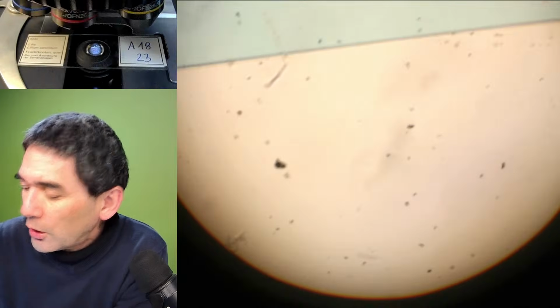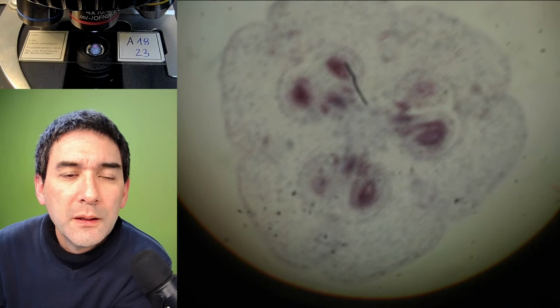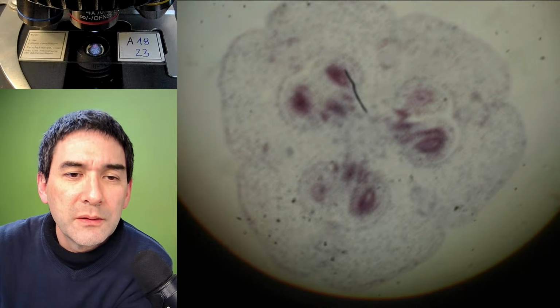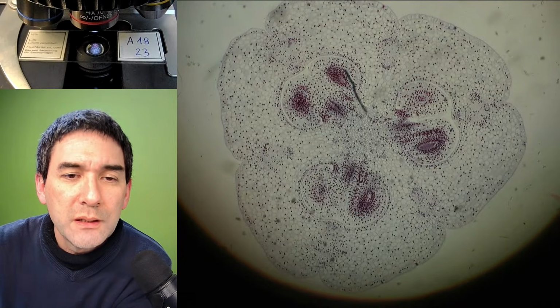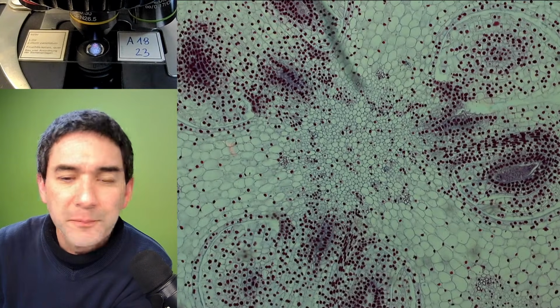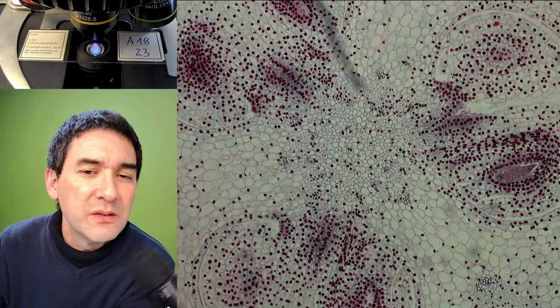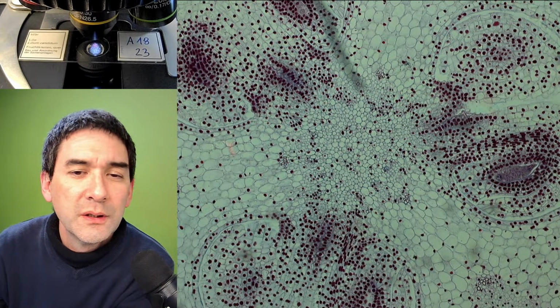I always start at the lowest magnification. Here we go. Again, it's a little bit dirty, but each tiny little dot is a nucleus. So this is a stained specimen. If I change the prism around, you see it doesn't make a huge difference here.